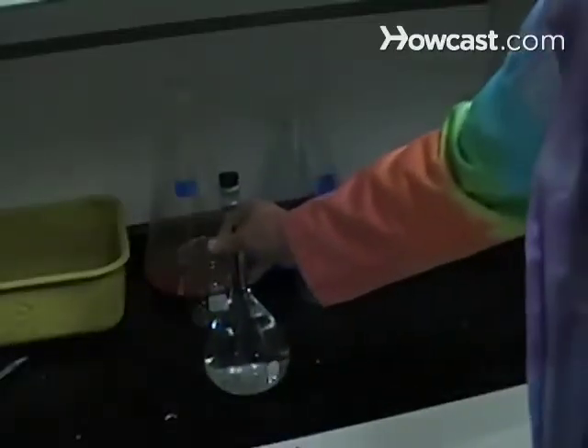Step 7. Store the solution with a stopper. If you plan to use it for titration, it's good practice to conduct the experiment while the solution is still fresh.